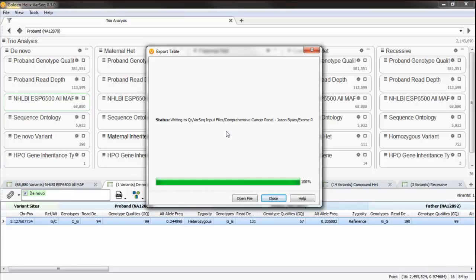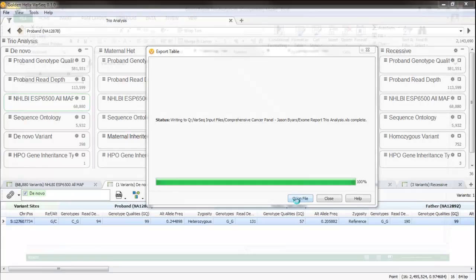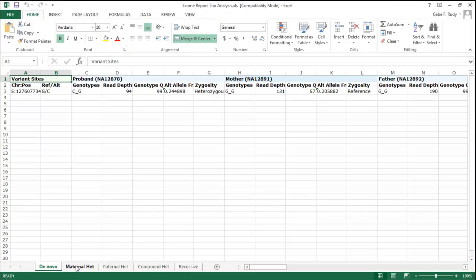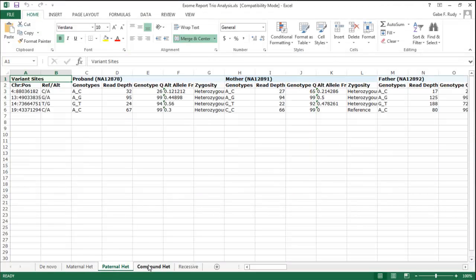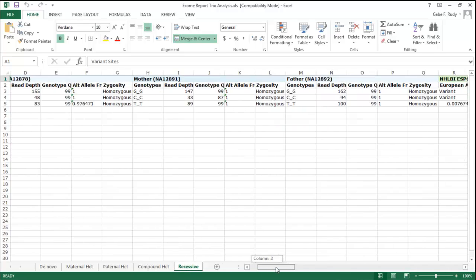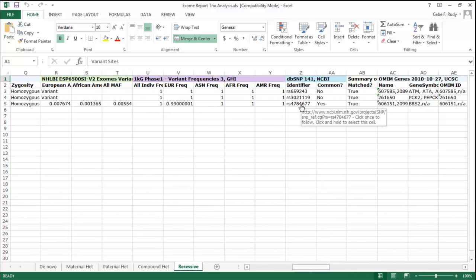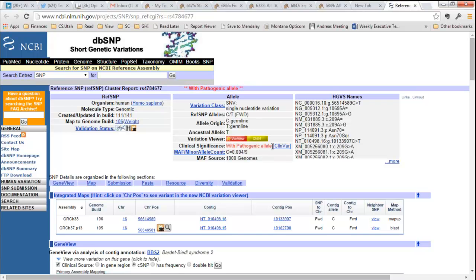In just a matter of seconds, I can have all that data exported into a multi-tab Excel, and here it is, each of the tabs containing each of those sets of variants in each table. And of course, all those hyperlinks that you are seeing that we can drill down into are still available. They're right here on the text, so here's the dbSNP column. We can click on that. We can see the data from dbSNP because it will pop open in a browser. This has a pathogenic allele annotated in ClinVar, etc.